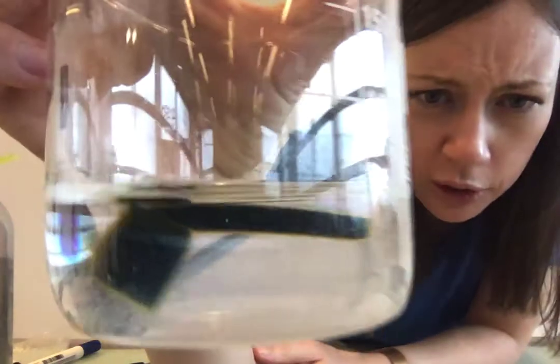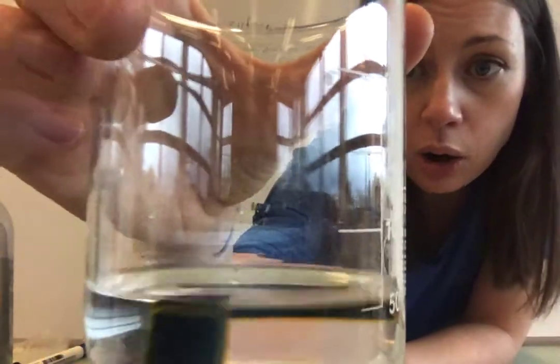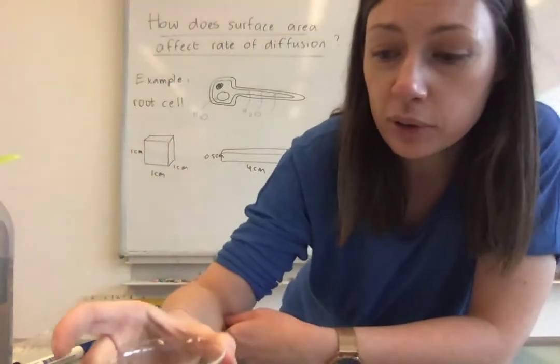So you can already see that it's starting to change from a blue to a yellow. So I'm going to wait to see how long it takes for the whole shape to change to yellow altogether, completely yellow. So I'm going to wait there.